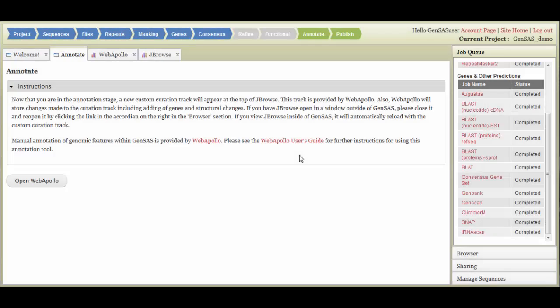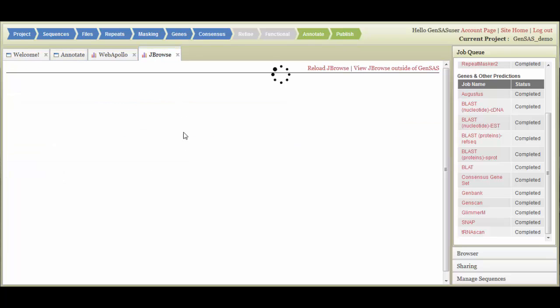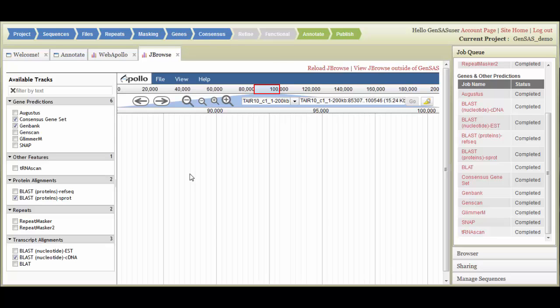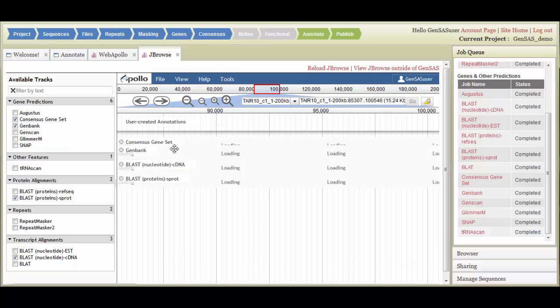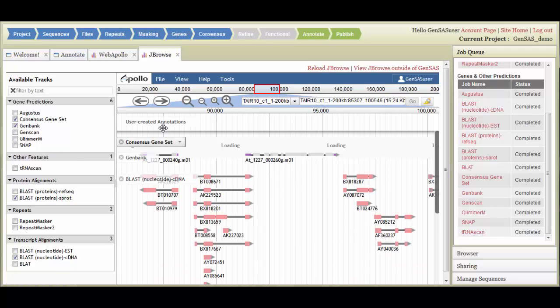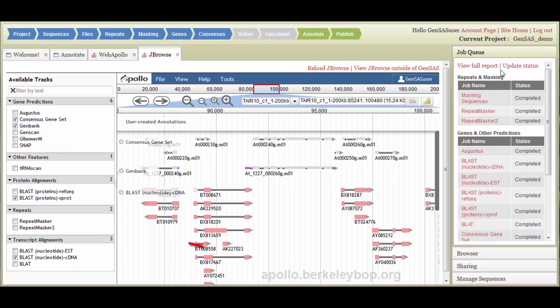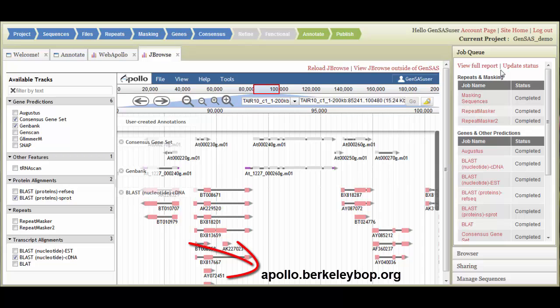During the Annotate stage, you can use WebApollo to manually refine your annotation. During this step, an editable user-created annotation track appears on the JBrowse tab and any changes that are made to this track are logged on the WebApollo tab. I am going to show you some basics for using WebApollo, but please read the documentation at the below website.